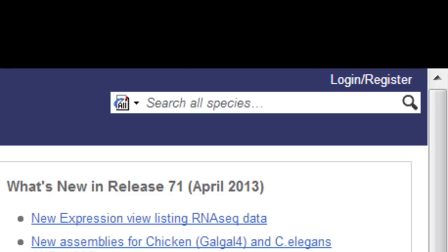Whatever computer I log in from, I can access my data. Plus, registration is free. I'm going to log in here.